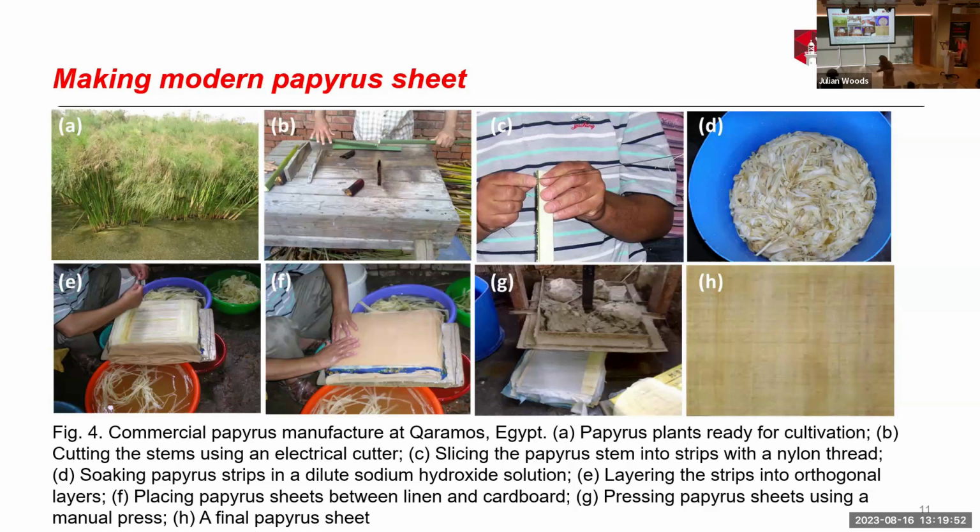something important, conservation. As I told you before, we need to conserve papyrus. When papyrus is exposed to deterioration from age, environment, pollution, or something else, it can deteriorate and turn into fragile material. So we need to conserve this object, but how can analysis help us? Analysis can help by identifying the materials. For example, when we analyze the ink, we can decide which kind of ink we are working with. And when we know the ink, we can choose the most suitable technique for treatment.